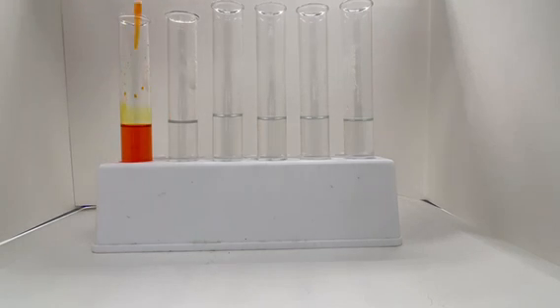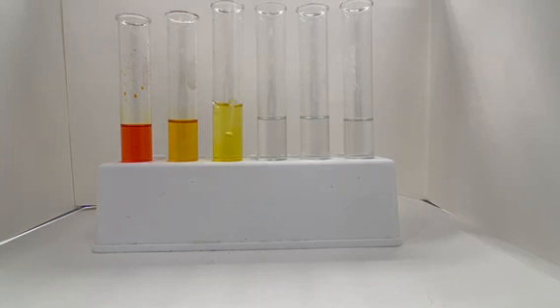You will need a stock solution, a pipette, and a container for mixing, such as a beaker or a test tube. Using the pipette, carefully measure 1 unit of your stock solution. This could be 1 milliliter, 1 microliter, or any other unit of volume depending on your needs.